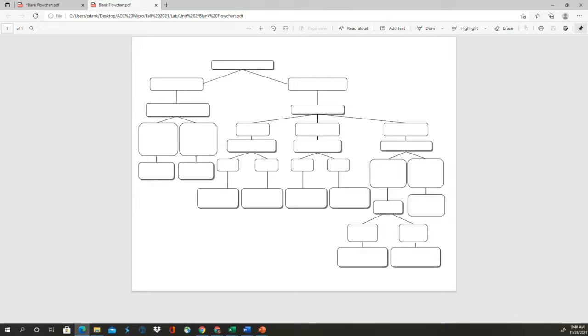Okay, so when you have your branch, you're going to end up with 3 lactose fermenters and 5 lactose non-fermenters, okay? And there's actually 2 different media that you can use here to do the split. Just make sure that you are meeting all the requirements of the assignment, but that you're not just doing separate individual columns for each of the unknown organisms. It needs to clearly delineate.